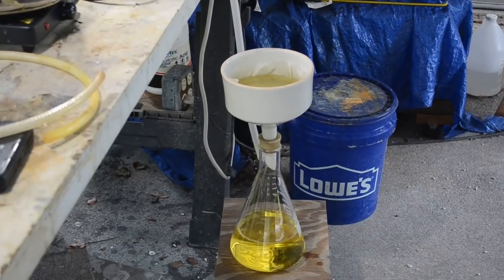As I feared, the filtration is going very slowly. Siphoning just wasn't working because it was coming into the Buchner funnel faster than it could go through the filter. So I've taken to using one of my smaller beakers to just dip liquid into the funnel as needed. But the filtrate is coming through very, very clear and clean. And there's some dark stuff in the funnel. Let me show you that.